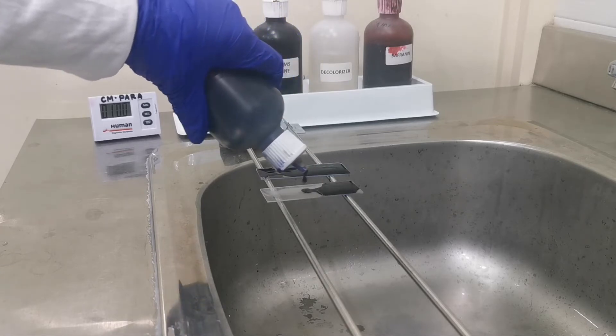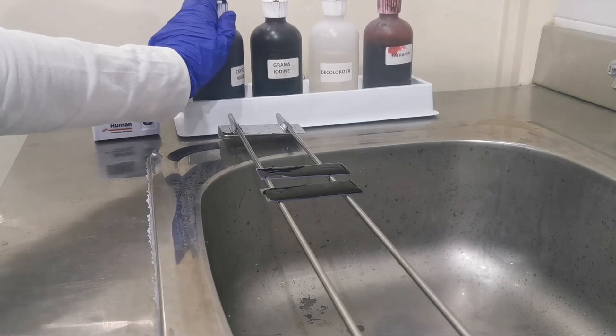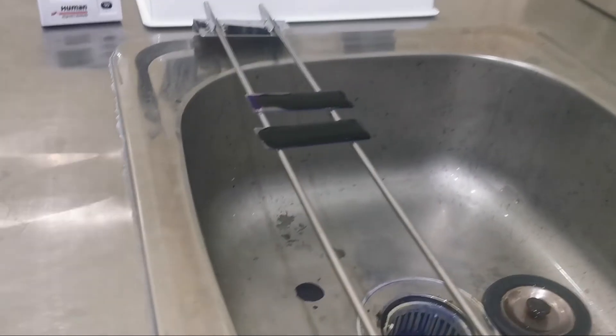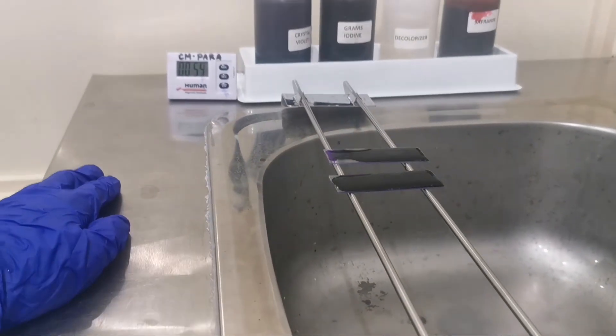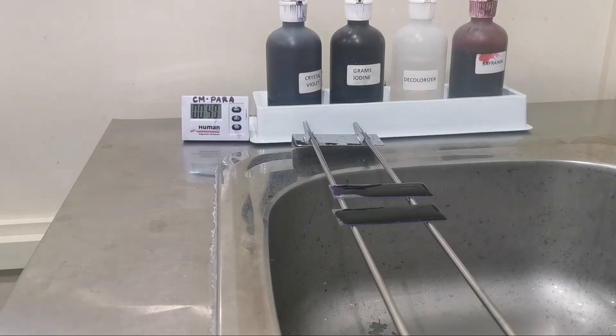Now let's flood the slide with our crystal violet stain — this will take about one minute. Crystal violet stains gram-positive bacteria because they have a thick layer of peptidoglycan, and this thick peptidoglycan layer is the reason why gram-positive bacteria retain the violet stain after all the staining steps are done.